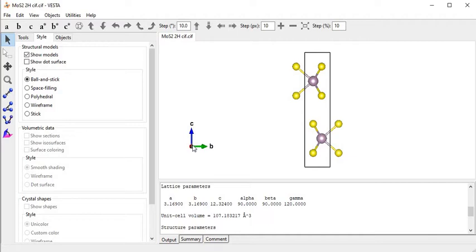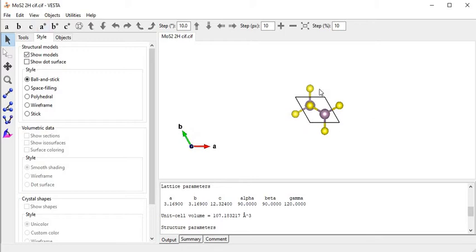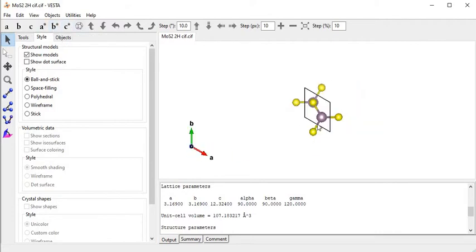Now I click on 'b' so the b-vector is directed outward from the screen, and during that time the crystal looks like that. Now I click on 'c' - along the c-axis the crystal looks like this, and the dotted continuous black region is the unit cell of the crystal. Now I am clicking view along the A-star axis, which is the reciprocal axis, then B-star axis similarly, and C-star.